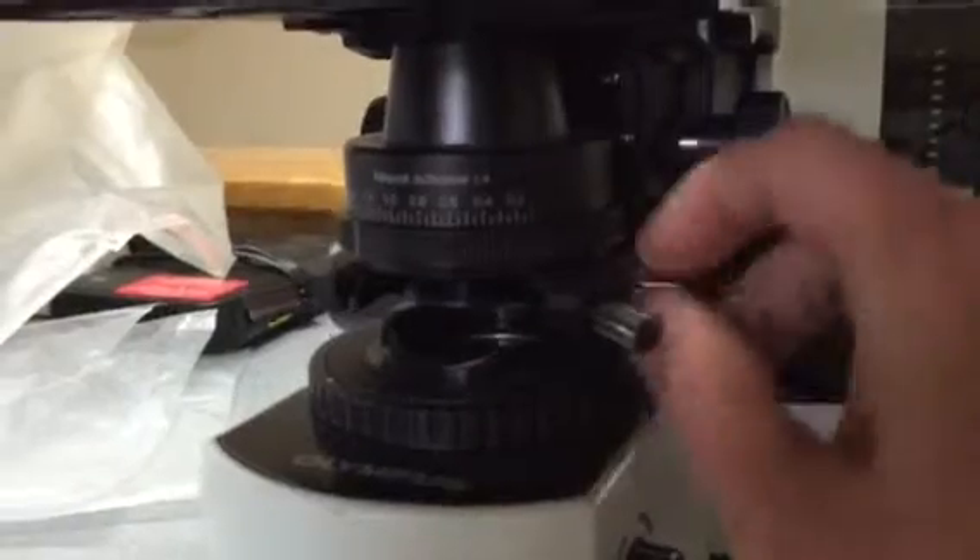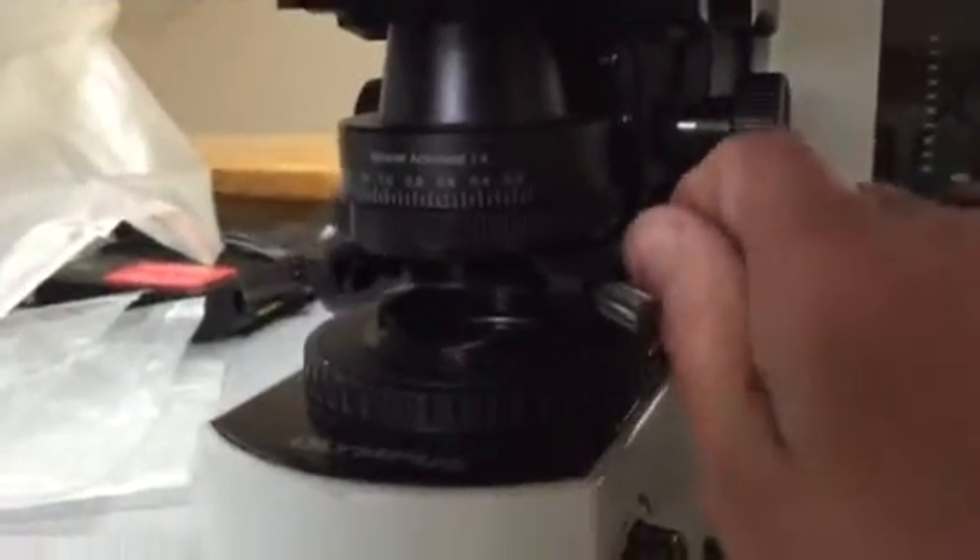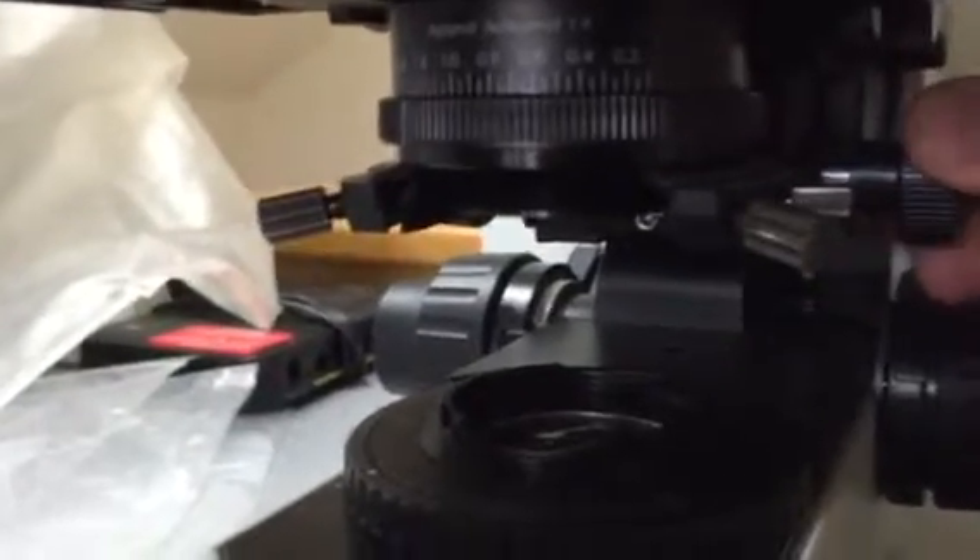Tighten this same screw. Then go to the height adjustment and rack it all the way up to where it just barely touches the bottom of your slide. Then turn it back down just a little bit so it's sitting right below your slide.